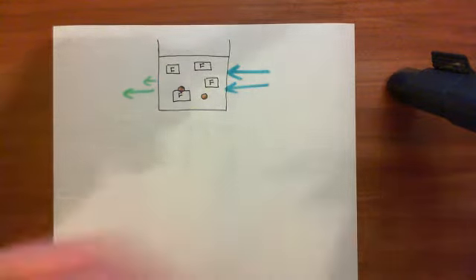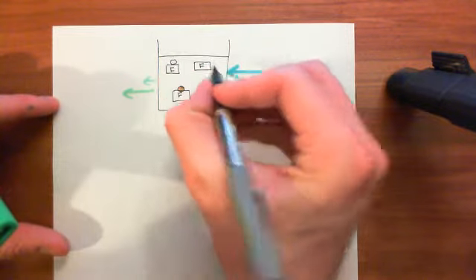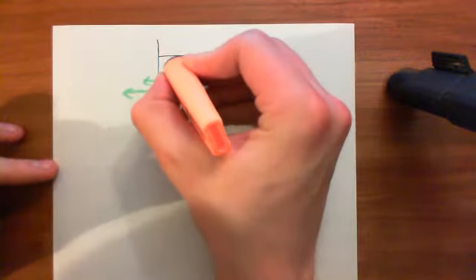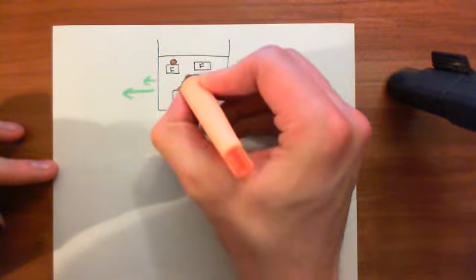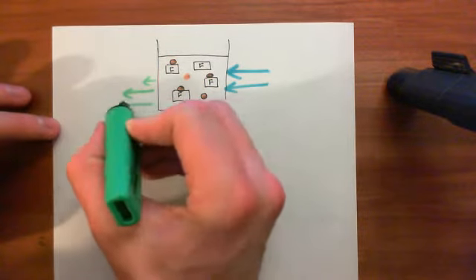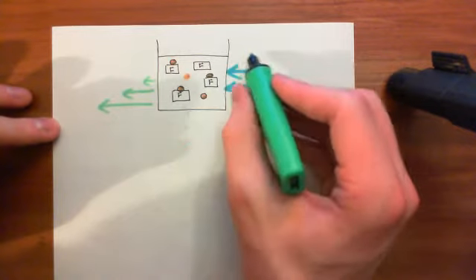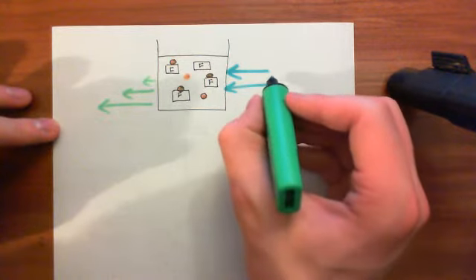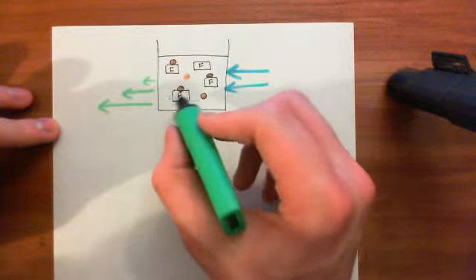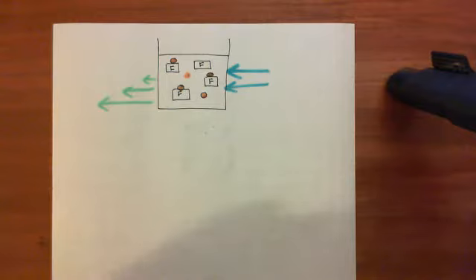Then if we pour in more calcium ions, more of these Fluo-4 molecules will end up with calcium bound to them, shown here in orange. Now the fluorescent properties are going to go up even more, so the amount of fluorescence we'll get is going to increase. And note, we have not changed the amount of blue light we are shining on. The blue light has been kept constant. This is not changing, but the fluorescent signal is changing simply because we are adding calcium into the solution.